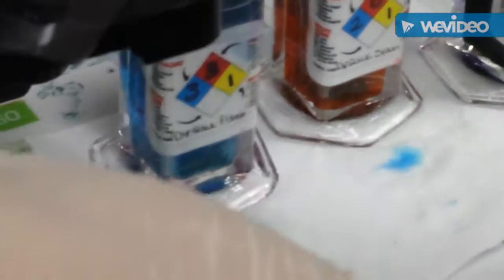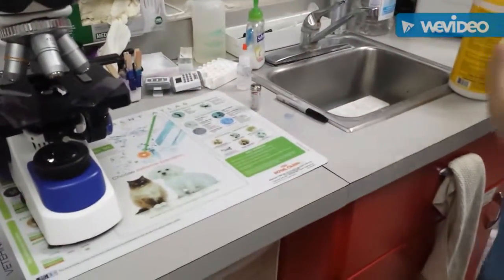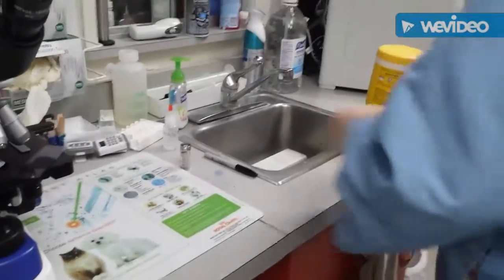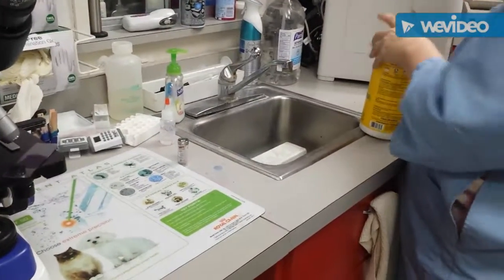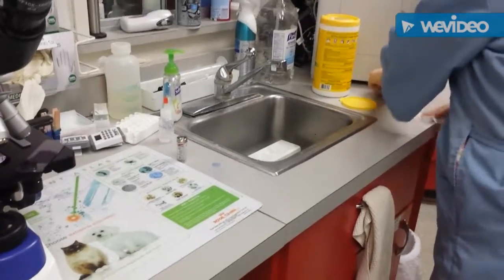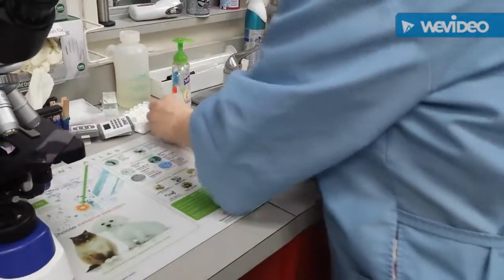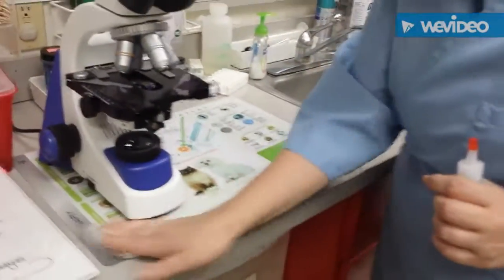So we're going to go ahead and set those up there for the doctor. And then we're going to go ahead and clean up our mess so that when she comes out, she's not tripping over everything. So we're going to pick all of our stuff up, go ahead and throw it all away. And then we're going to go ahead and just wipe up the whole area around here so that we can get everything cleared up for her. And that is the end of our task.